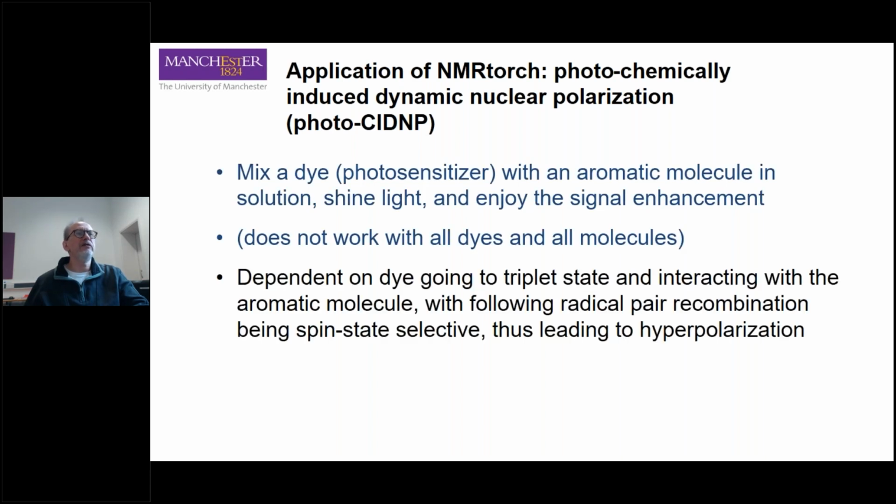This effect is dependent on dye absorbing light, going to triplet state, and interacting with aromatic molecule, with following radical pair recombination being spin state selective, thus leading to hyperpolarization. Importantly, observing this effect requires fairly strong illumination, and traditionally, to obtain strong enhancements, it has been done with lasers.